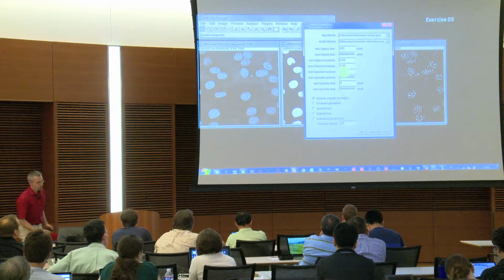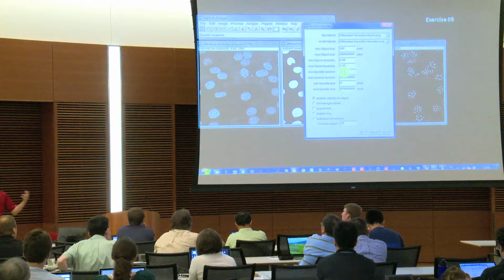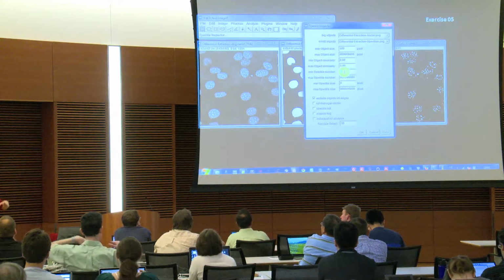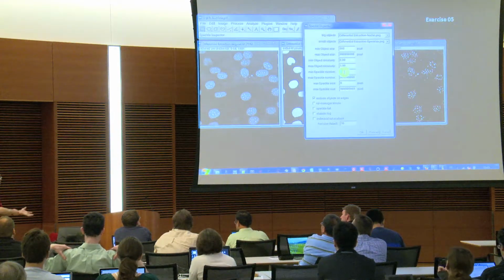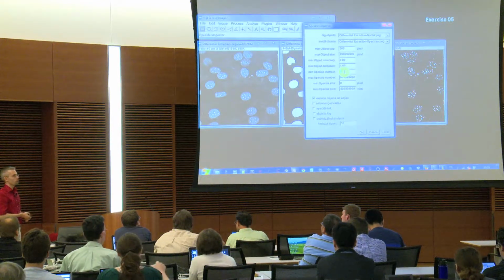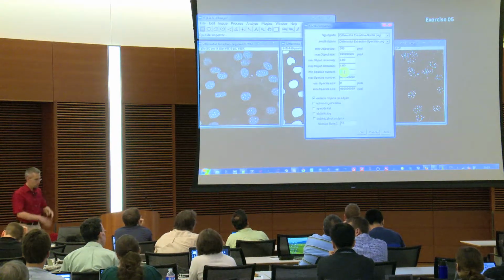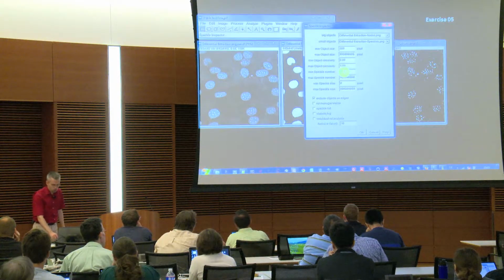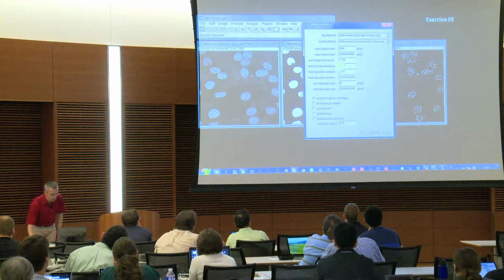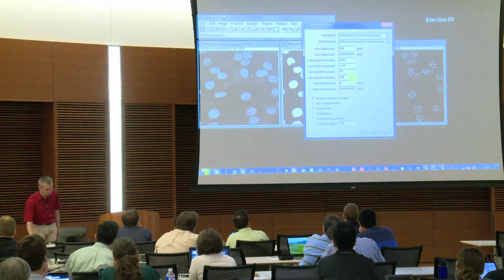So now to the settings, the speckle number. It might be the case that you have an experiment where your control experiment has always a basal number of small objects and you want to show that separately. So if in your treated sample you have a similar number or a lower number than in your control, you might want this to be indicated in that image. So here, just arbitrarily chosen, if I get an object which has less than 10, it should indicate that. And if it has more than 20, it should also indicate that. And you will see how that looks.